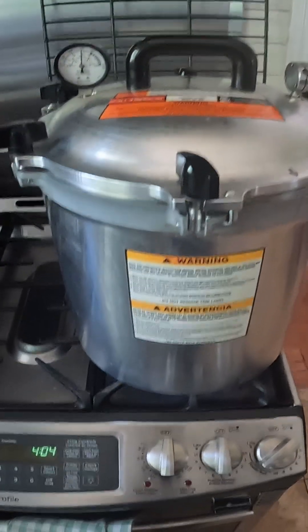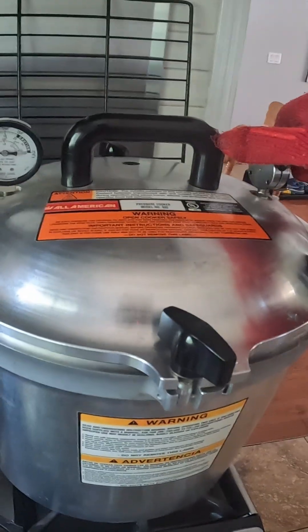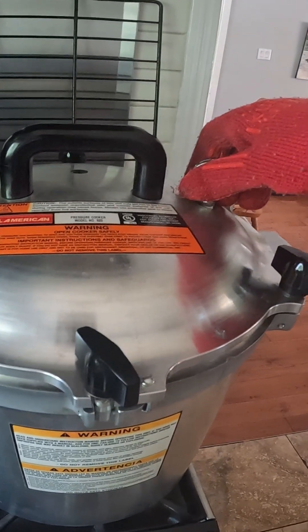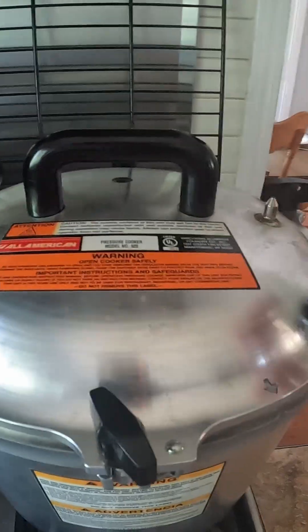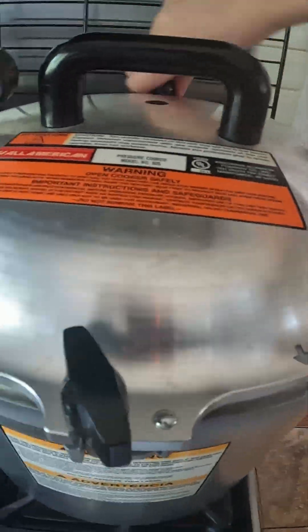After it's done, you're going to turn off the heat and allow it to depressurize to 0 psi. Once it hits 0 psi, you're going to vent it for a total of 2 minutes. Do not remove the weight prior. You're then going to unscrew everything and take the lid off and allow it to cool down.